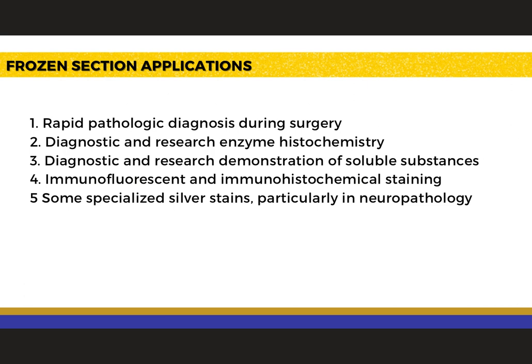So, what are the applications of your frozen section? This is used for rapid pathologic diagnosis during surgery, diagnostic and research enzyme histochemistry, diagnostic and research demonstration of soluble substances like your lipids and carbohydrates, immunofluorescent and immunohistochemical staining, and some specialized silver stains in neuropathology. So please remember the different applications of your frozen section.